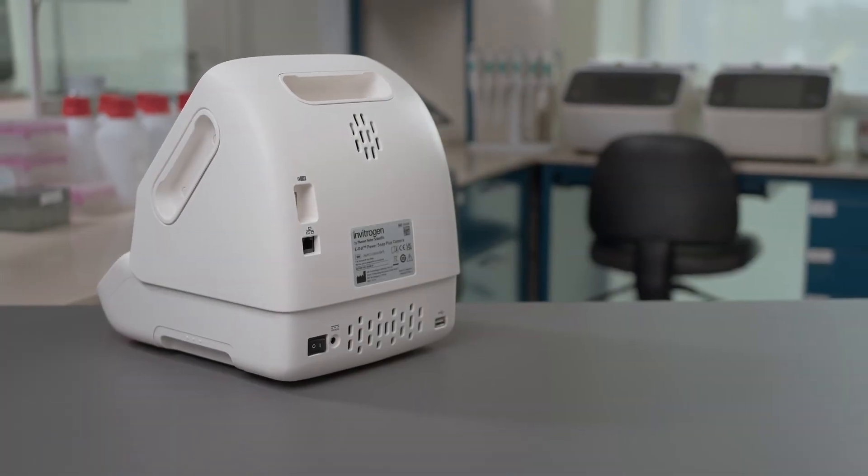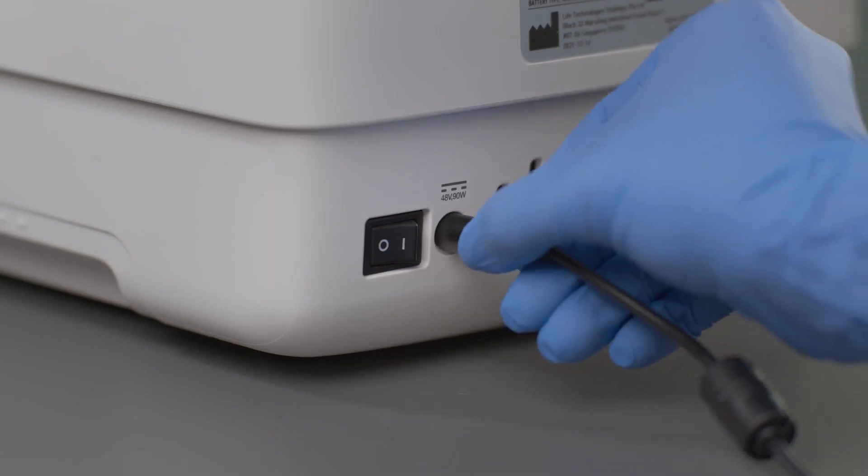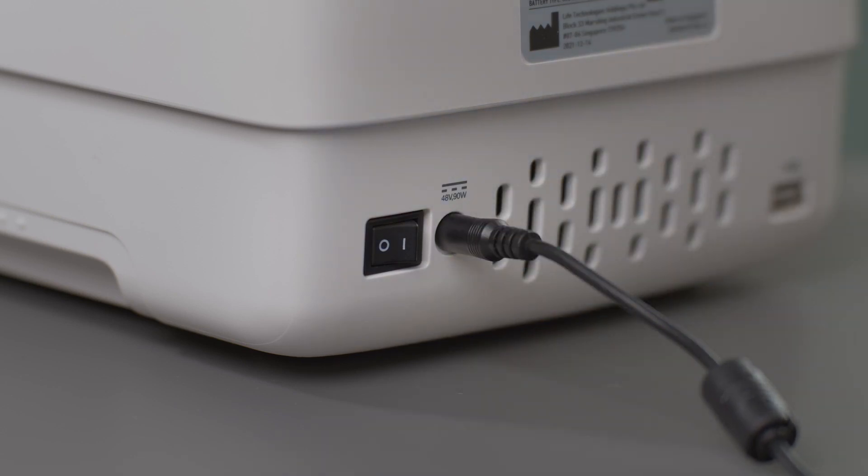Connect the power cable to the power adapter. Insert the adapter plug into the eGel PowerSnap Plus system and plug the power cord into an electrical outlet.